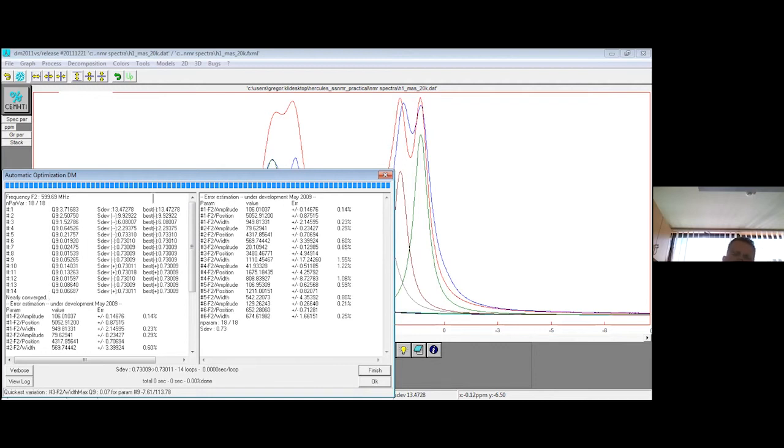If you see that during these iterations the deviation between the model and the experiment is getting better and better and not converged, then you simply push the bulb once again and continue. If you see that this doesn't work, then perhaps it doesn't go in some better direction, and you need to modify the initial model.